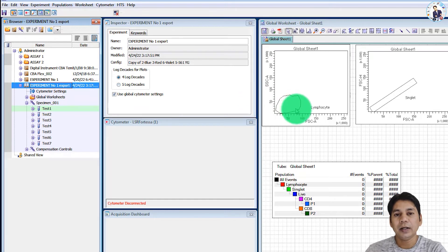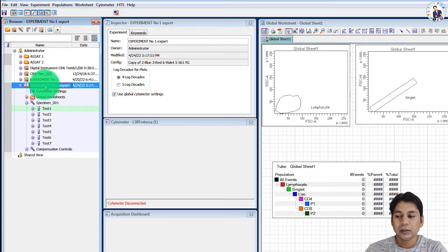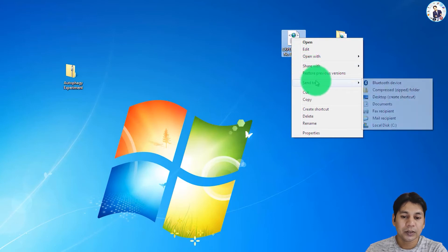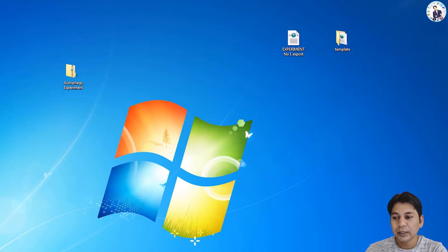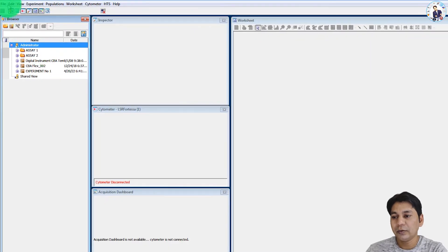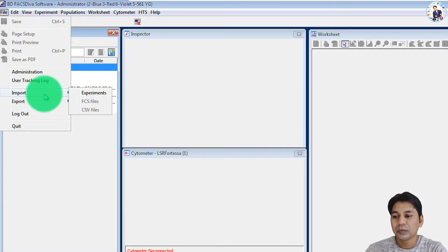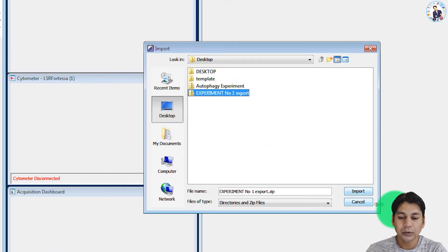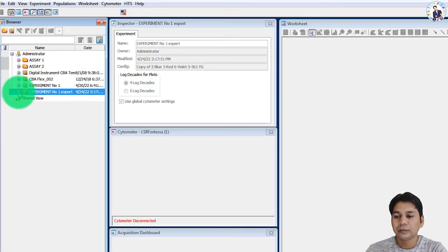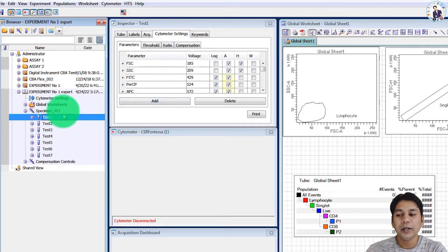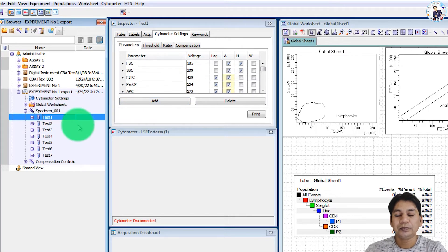The second way to import is by using a zip file. Right-click on the experiment template file and select 'Send to' → 'Compressed (zipped) folder.' A zip file is prepared from the experiment template. Now open FACSDiva software, click File → Import → Import Experiment, select the zip file for experiment number one export, and click Import. The experiment template is imported into FACSDiva software.